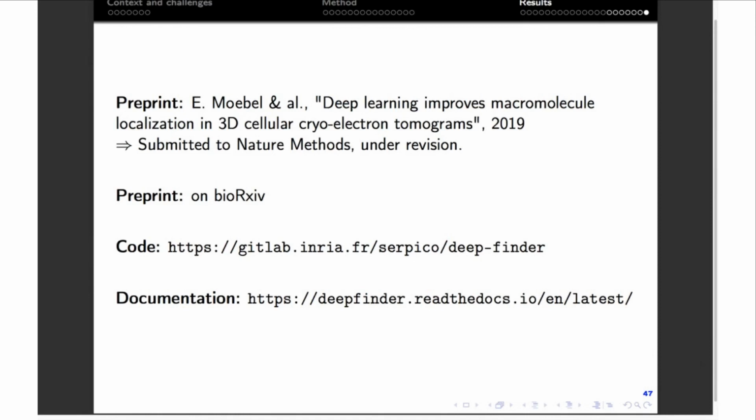No, I didn't do that because in my case, the sphere center is what is produced by the person who annotates, and also the radius of the sphere is most of the time known because the biologist has an idea of how large the target macromolecule is. And the sphere radius corresponds approximately to the macromolecule radius. Thank you, Emmanuel.